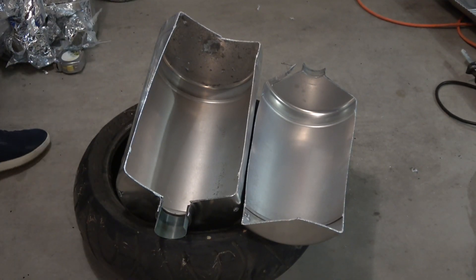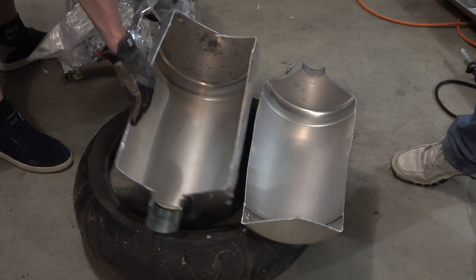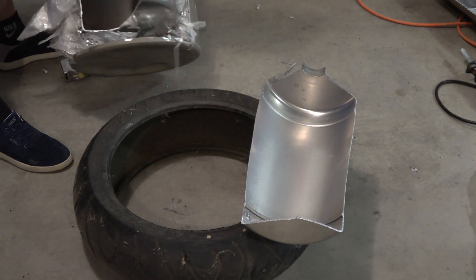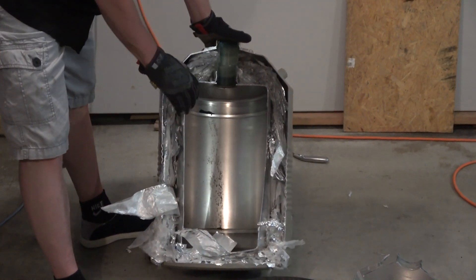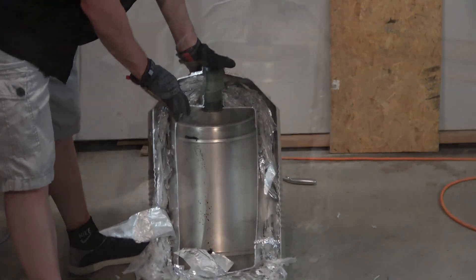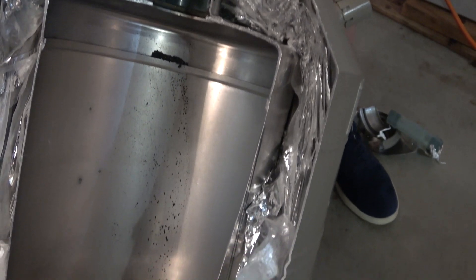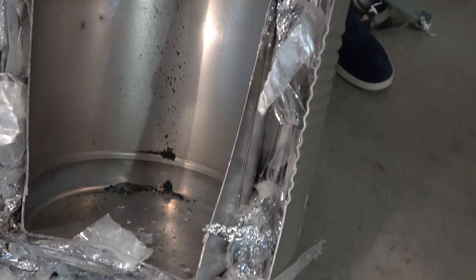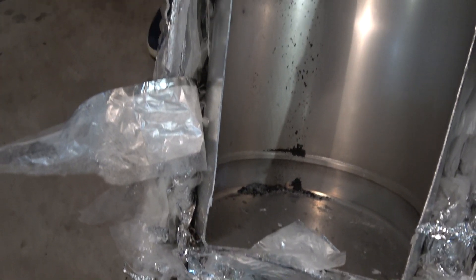And now what are we gonna do with it? I think this deserves a close-up. And there you have it — one fully dissected dewar, slightly used.